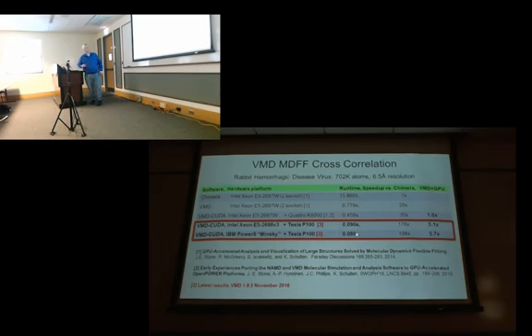Just to give you another example of how much the technological improvements in the program impact the performance. This is a cross-correlation calculation on that same rabbit hemorrhagic disease virus using Chimera, and I think Chimera just has a single-threaded implementation. That takes 15.8 seconds. Using the one in VMD just on the CPUs is 0.7 seconds. If you use VMD with the GPUs, it's 0.4.